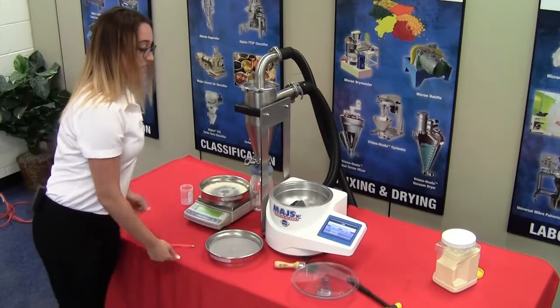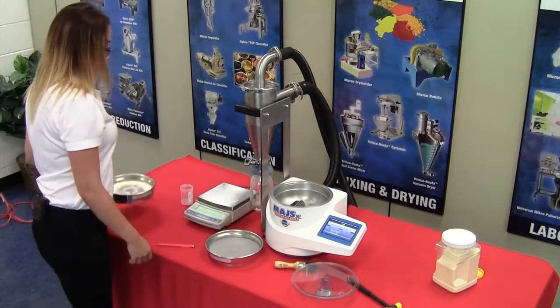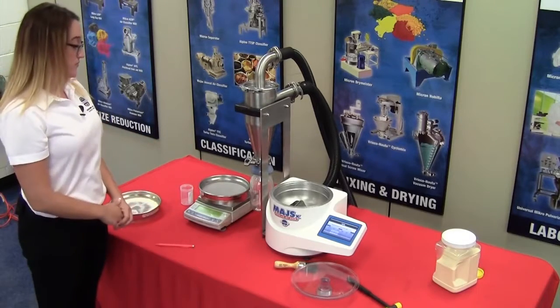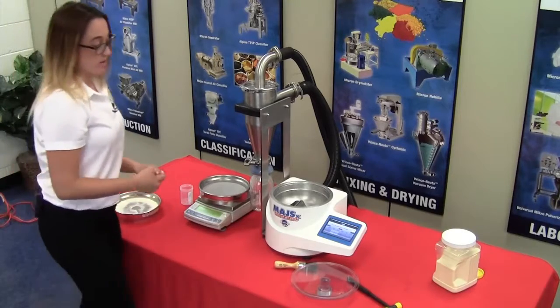Then it's saying place the 53 micron screen on the scale. So we're going to remove this one, let the scale go back down to 0, and place the next screen in our analysis on the scale. Again, once it communicates and registers the proper weight, we're going to press next.